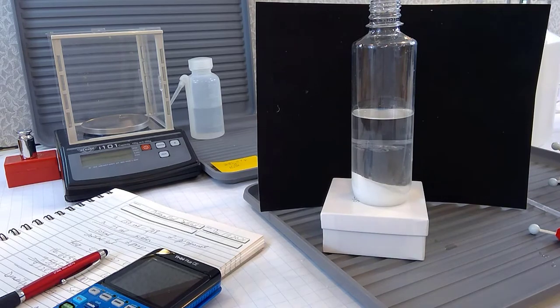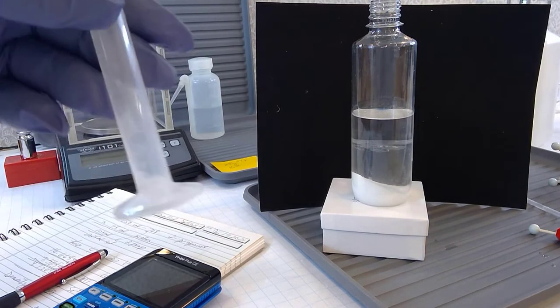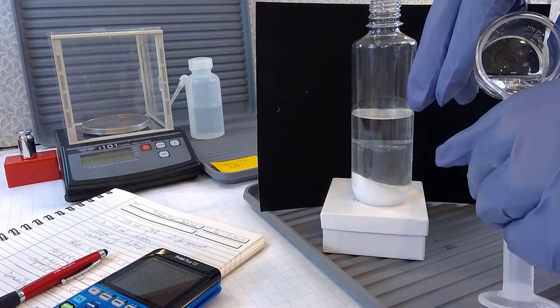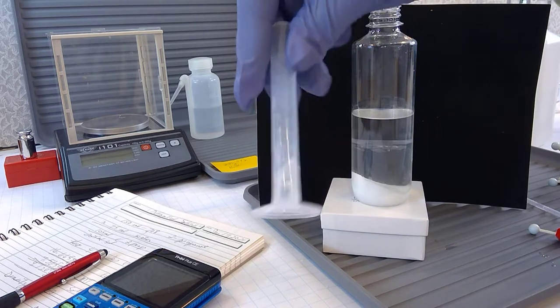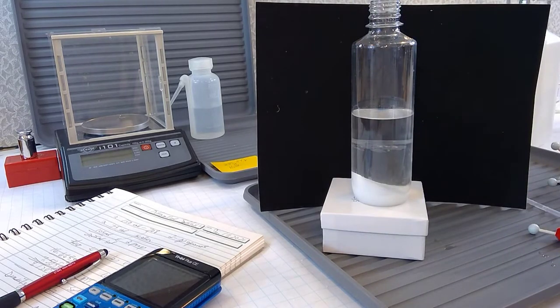Now, it's not quite dry. It's got some liquid in it, but drying one of these things afterwards is really difficult. So what I'll do is pour some of this liquid into here and swirl it around. So my impurity, my previous liquid in there, is going to be mixing with this, and I'm going to now dump it out into my waste container. Here it is.